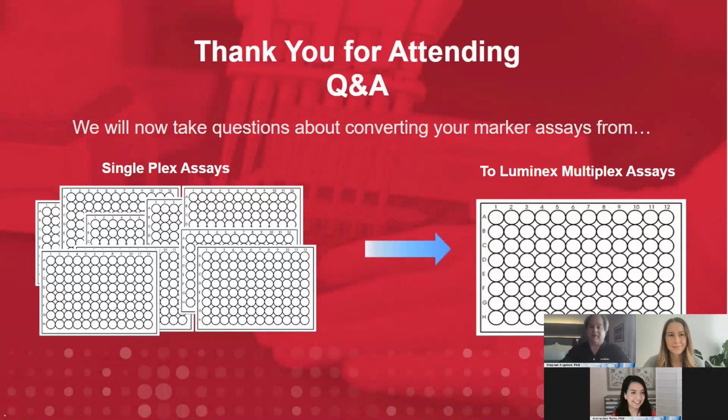Well, as Jackie and I said, there's lots of them, actually. Most of them are proteomic. There are, like I said, one manufacturer, Thermo, does make some genomic assays. And they actually have quite an extensive library of genomic targets. And their chemistry can be used for looking at transcripts, so they can look at gene expression levels. And they can also look for specific, say, genomic or DNA-based sequences.